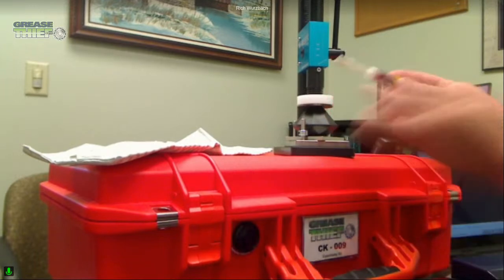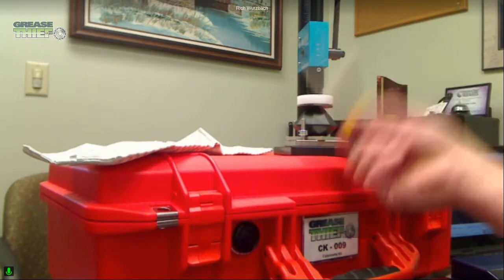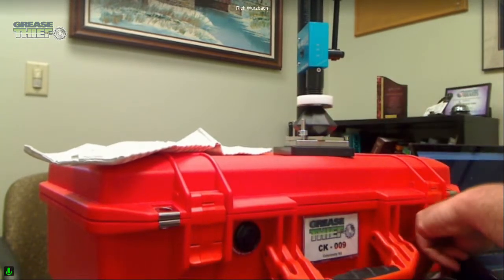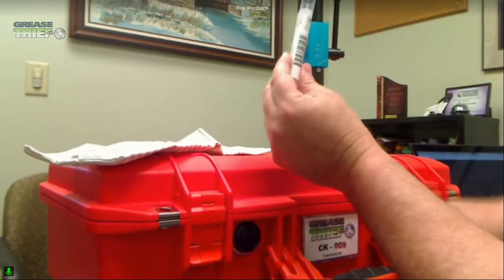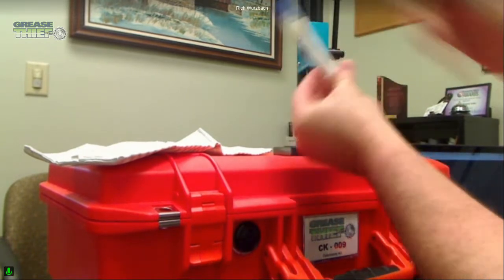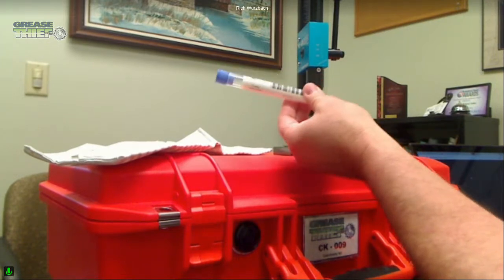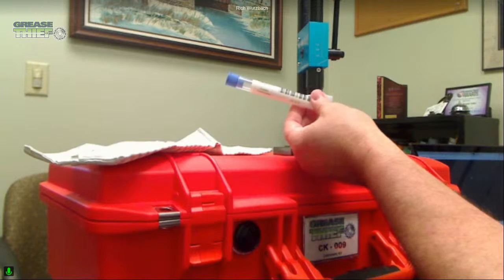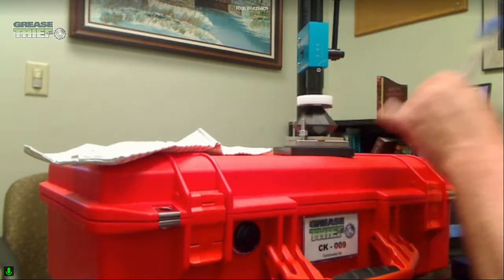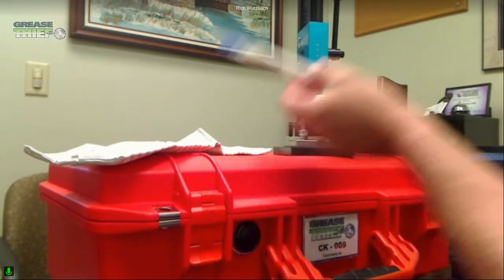Note too that between those 2 tests, I've used almost none of my grease sample, meaning that I can do this in the field. I can put this back into my tube for shipping, and if I see a problem, I can send that on to the laboratory and still get a full grease analysis from that sample that I took. So it's, again, valuing the time of people in the field, knowing how much effort it is to get to the asset in the case of a wind turbine, and having the flexibility to do the in-field testing, as well as having sample to send off for detailed analysis as well.